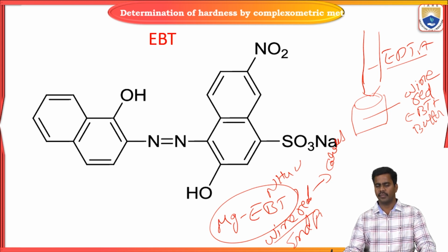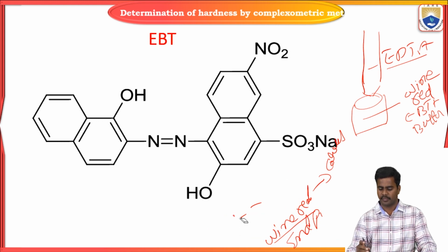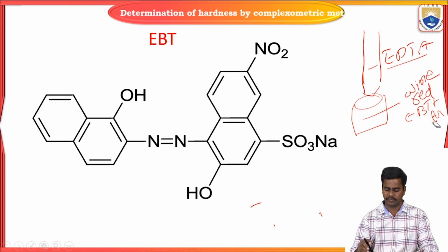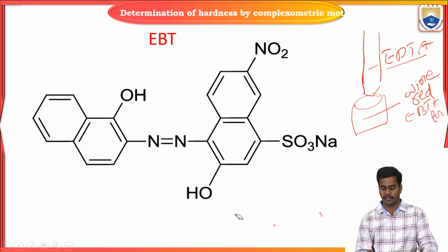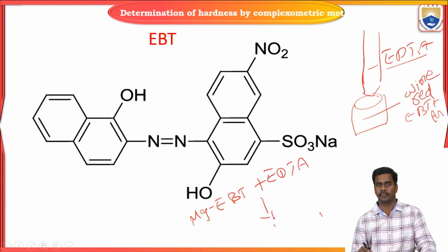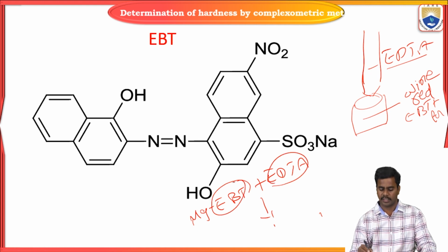Here, when you are adding EDTA to the magnesium EBT complex through the burette, EDTA can replace the EBT present in the complex.